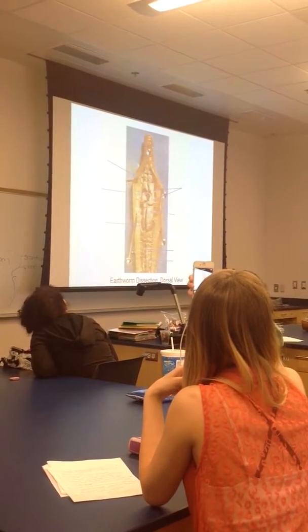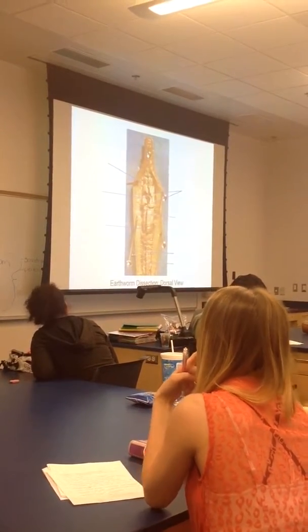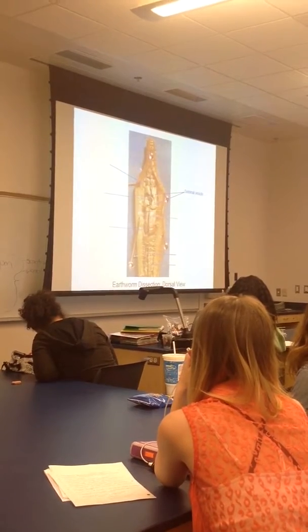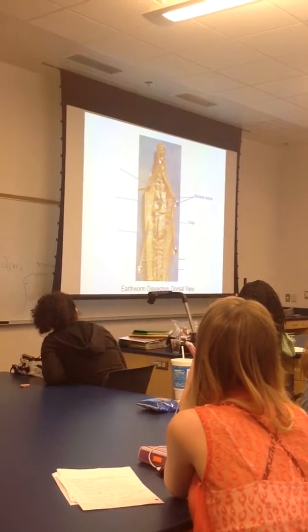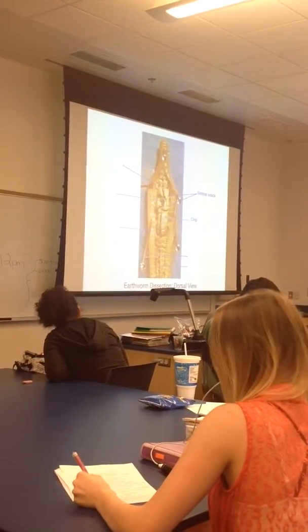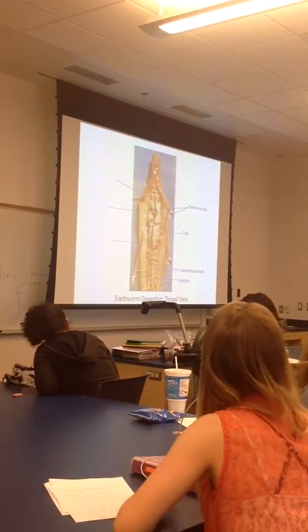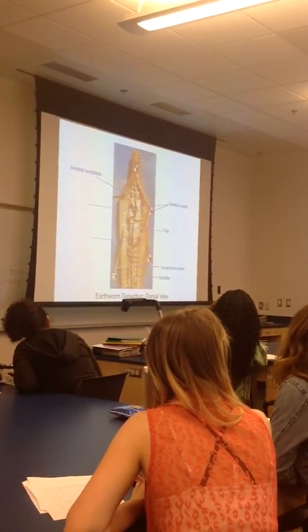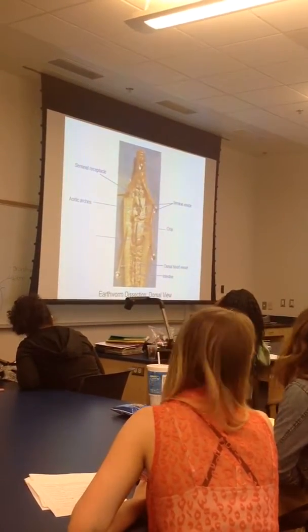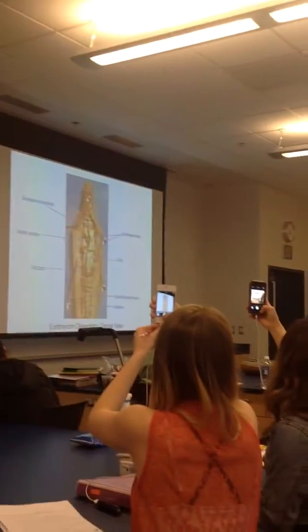All right. This is a little bit better. So, what are these here? Vesicles. This? Crop. What's that? Dorsal blood vessel. Intestine. What's this? Receptacles. Hearts or aortic arches, and the gizzard. Once you've identified them on one, you're pretty much okay with the rest.